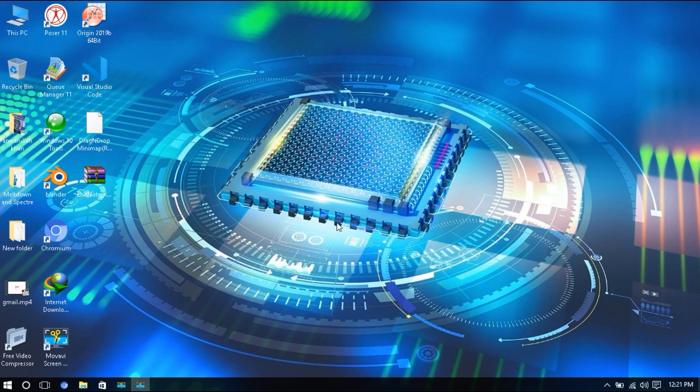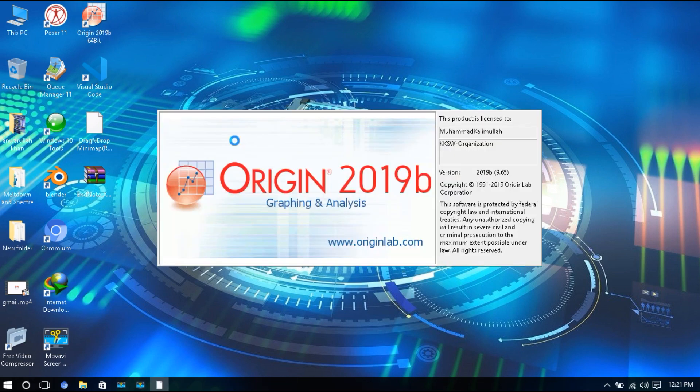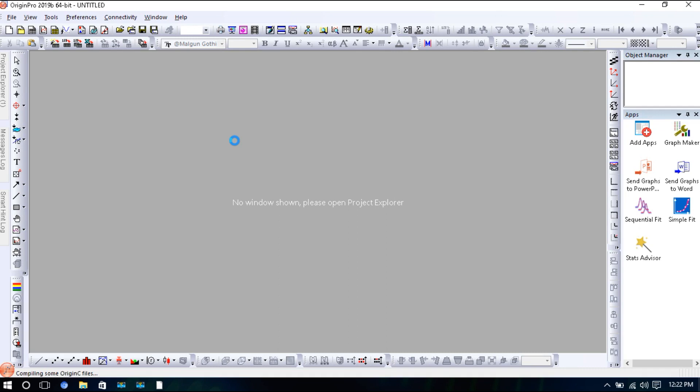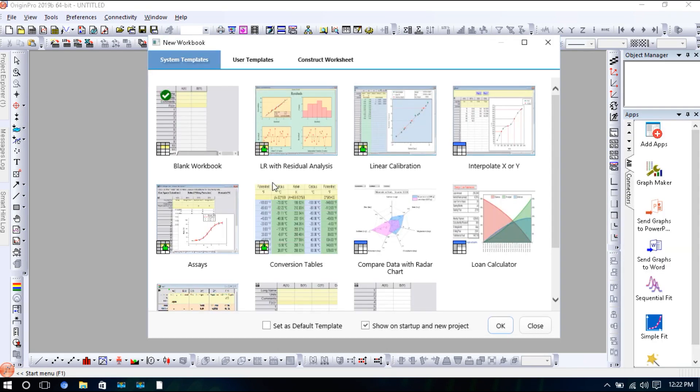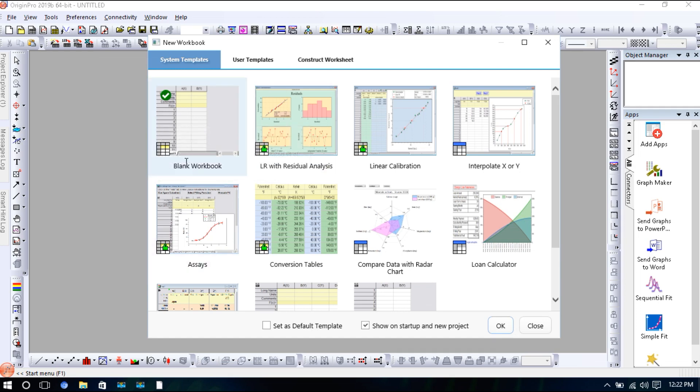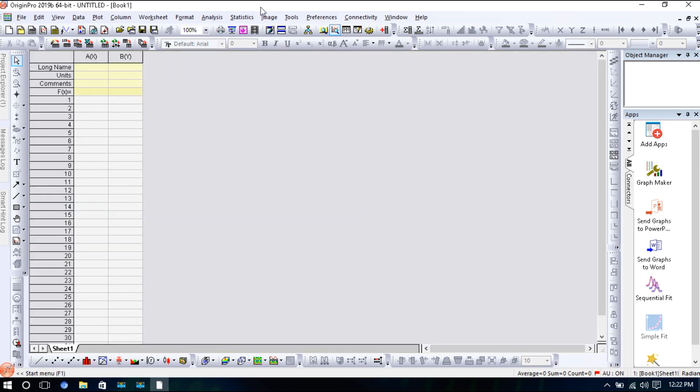In today's video, I will show you how to plot FTIR data using Origin Pro 2019. The first step is to open your Origin Pro software. Once it opens, we will open a blank worksheet or workbook.